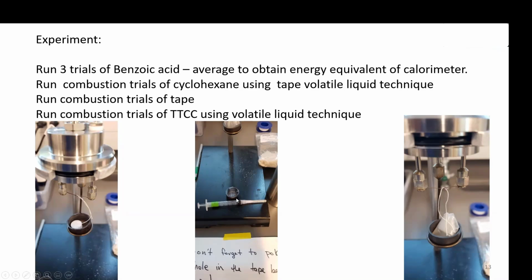We're going to put a tape on top of that cup, okay? And we will use a syringe to inject, so we poke a little hole onto that tape and inject the cyclohexane inside, and then we can measure the weight, and we will have the fuse in contact with the tape in that case.